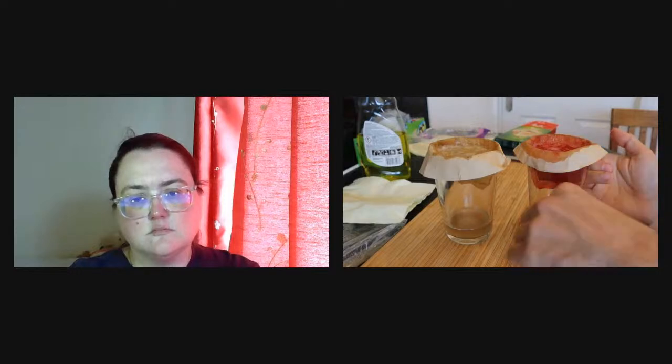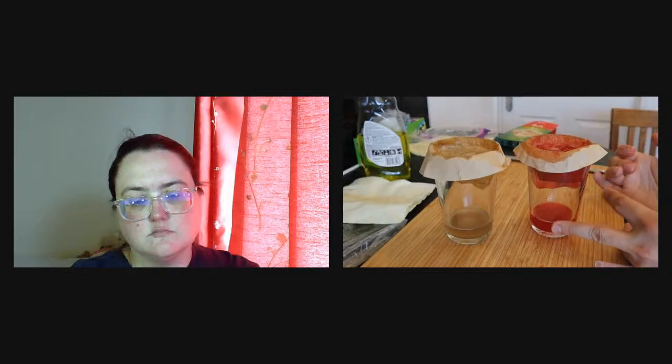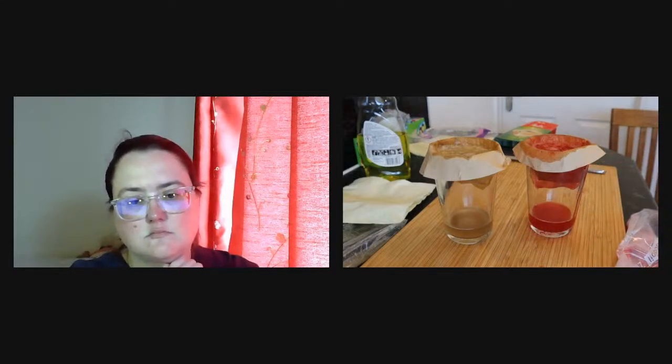What we want to have is a layer which is going to be around 1 centimeter or 2 centimeters, so probably 1 finger or 2 fingers at the bottom so that we can go further. So we are going to have to wait a little bit more at this point.